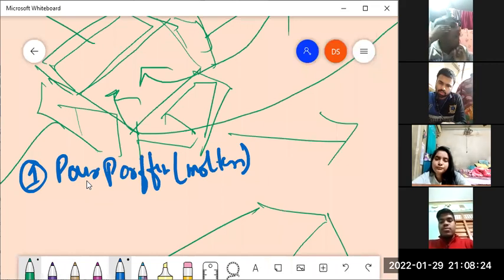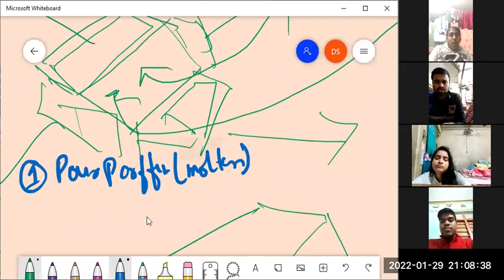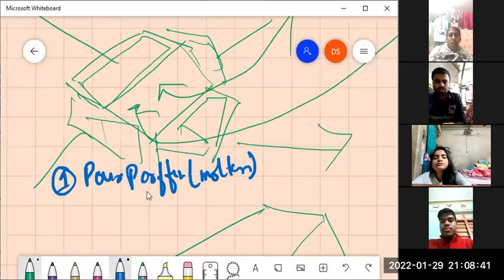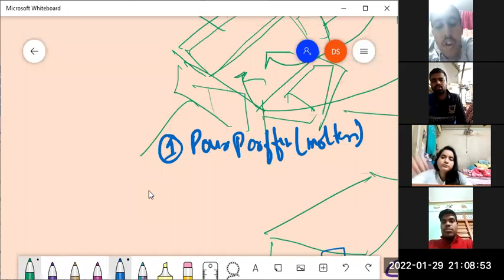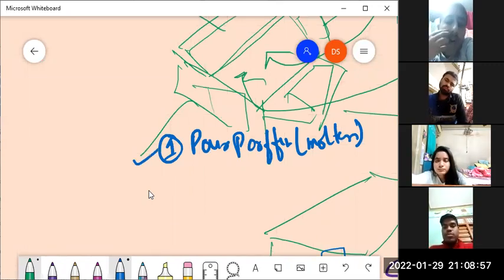Because if you completely fill up this block with molten paraffin, the tissue that you want to embed would remain floating over the surface of the paraffin, right? Liquid paraffin, that is wax, if you put something on top of the wax, would that material dissolve into the mass of the molten material? No. Right? So this block preparation would be in 3 steps.